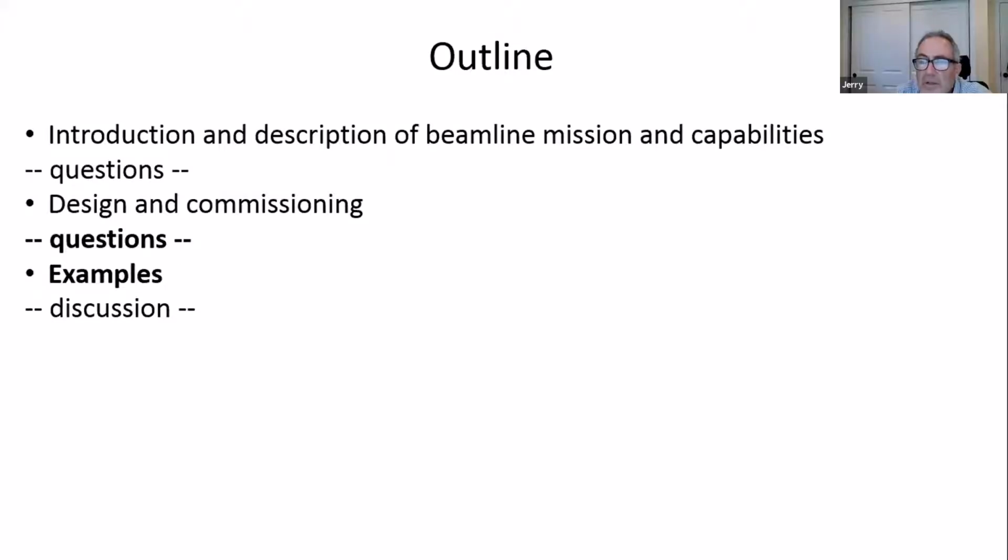Yeah, there is an example of a spectrometer my group's made, and we've used it at SSRL, that uses a 10-centimeter Rowland circle, and is very compact. Maybe you and I should talk about that later. Yeah, we also tried it at 1032, as you may recall. That's right. But it turned out that with bending magnet flux, there just wasn't much count rate there. So it was more of a demo than really useful. Okay, yeah. All right, so we should definitely ask about flux also.